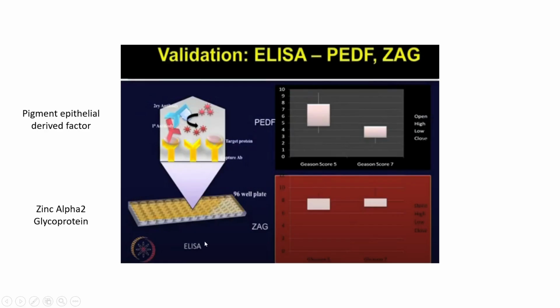They used the ELISA technique, wherein the specific antibody against that specific protein is present, and depending upon the concentration, that much will interact with it. I hope you all know how ELISA works. So that much amount interacted, and accordingly the concentration was determined.